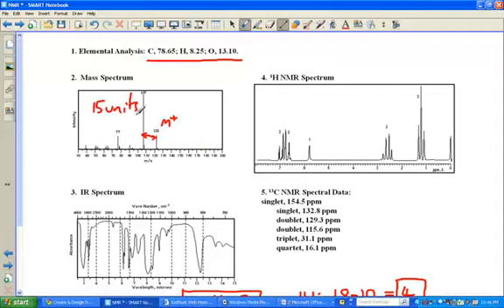And if you think, well, what group in an organic molecule has a mass of 15? Well, the only possibility is a CH3. It must have been a CH3 plus fragment in the mass spectrum. But what that tells us, not only do we have a molecular weight of 122, but in there somewhere, presumably on the end of the molecule somewhere, we have a CH3. That's some information that we didn't have before. That's one of the other useful things we can get from the mass spectrum.